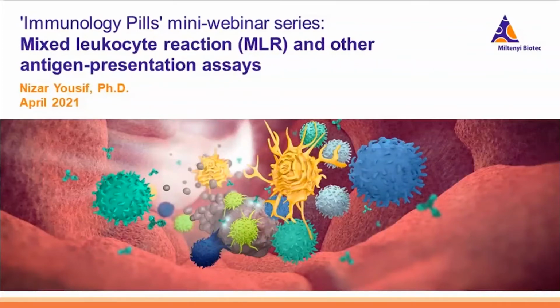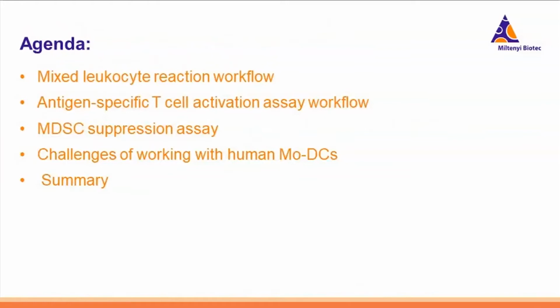Today, we will have together a short journey through the mixed leukocyte reaction and other presentation assays. This is the agenda of today. In this presentation, I will talk about mixed leukocyte reaction, the so-called MLR, and its workflow.